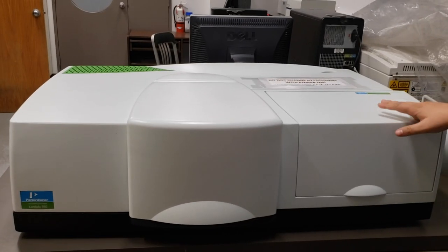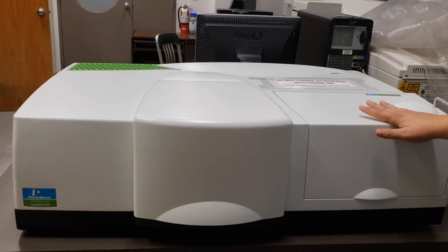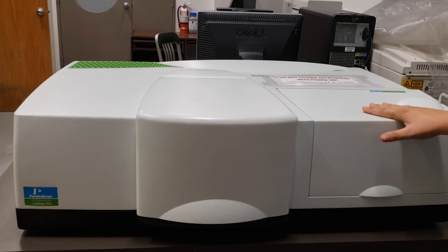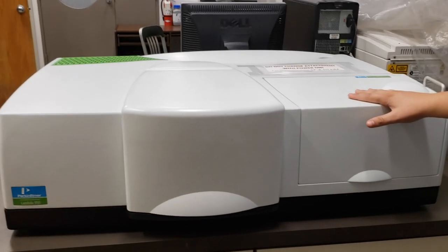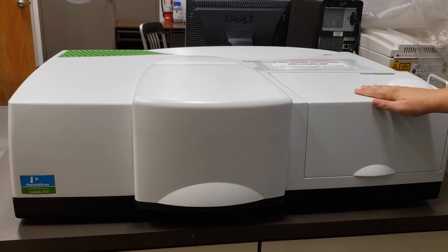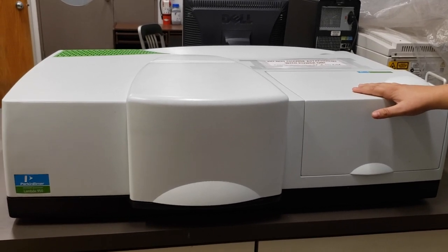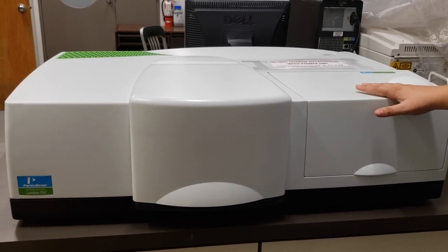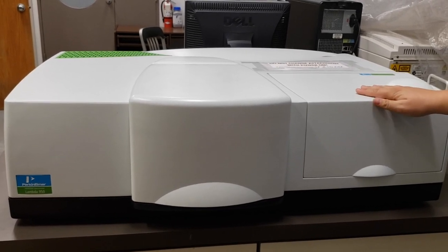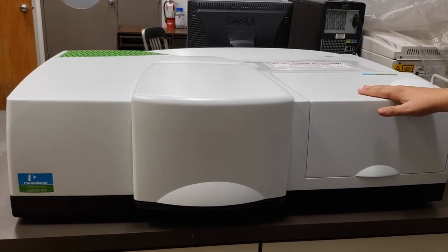About one hour before your scheduled time, the UV-Vis needs to be switched on to start warming up. For that reason, the earliest you could schedule to use the UV-Vis at the beginning of the day is 10 o'clock, since staff come in at 9 o'clock. It's also a good idea to stop by the lab one hour before your scheduled time to ensure it gets turned on, as staff get busy with other clients and don't always have time to turn it on with enough time before your session.